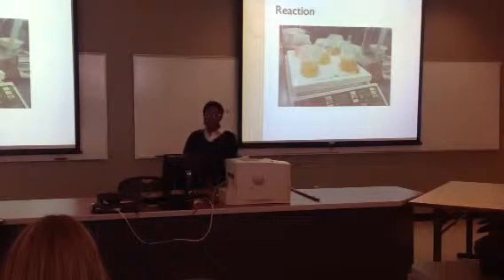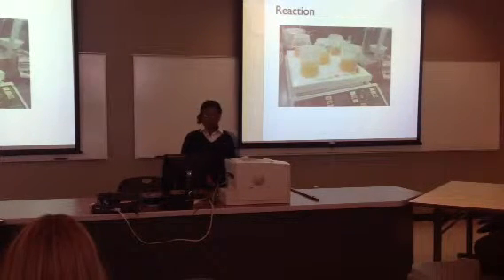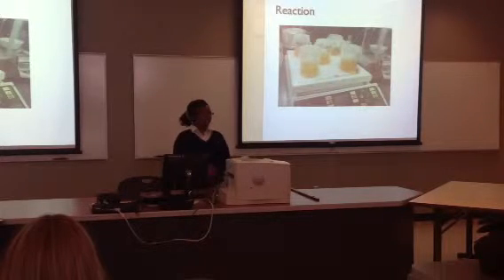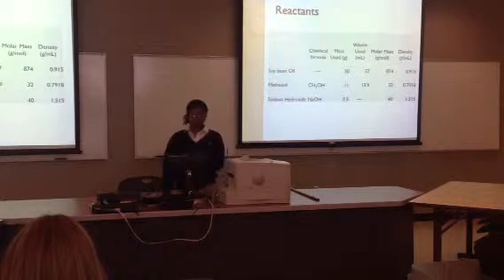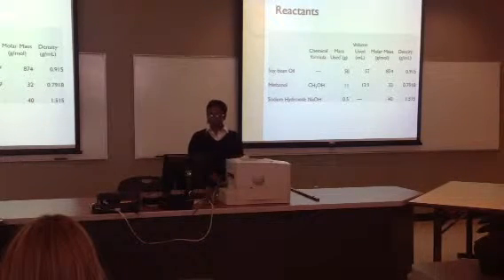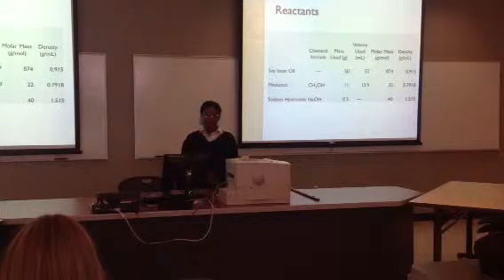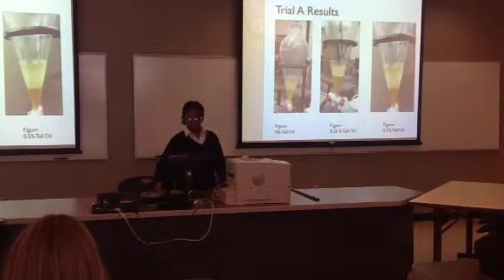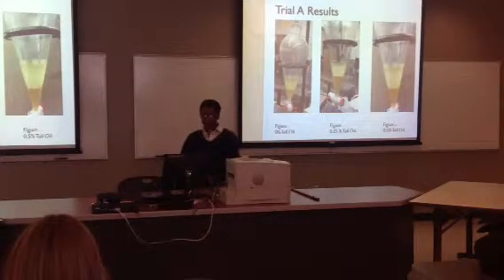And this is a picture of our experiment. We have a beaker on a hot plate covered with paraffin, and we indicate the time and percentage of tall oil. And these are the amounts of the reactants we use. We use 50 grams of soybean oil, 11 grams of methanol, and 0.5 grams of the sodium hydroxide, which we crushed. And here are the results.